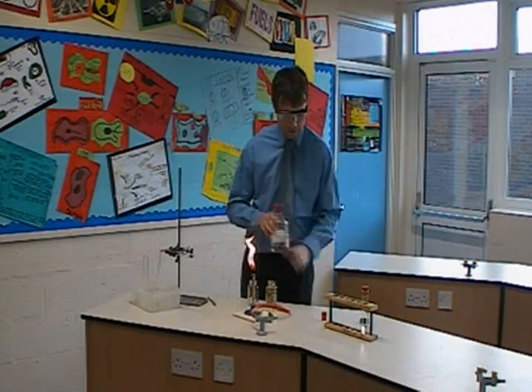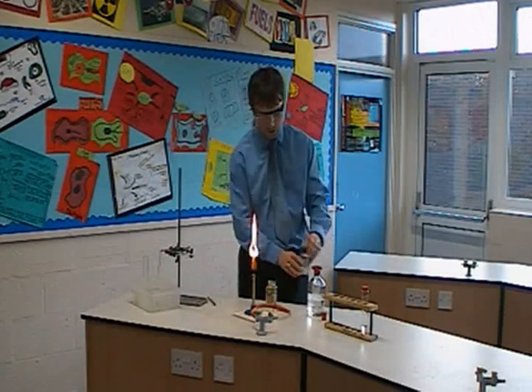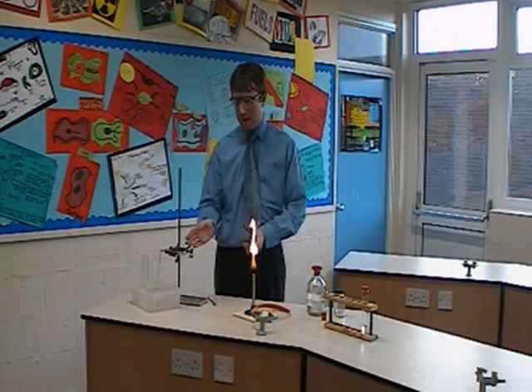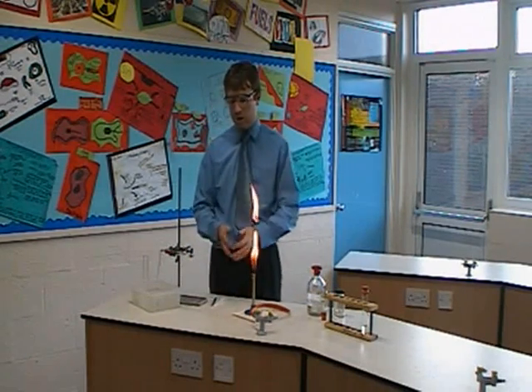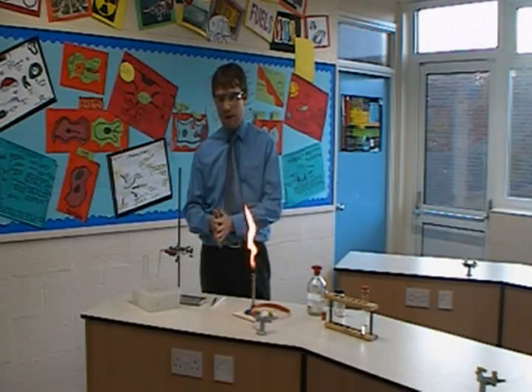The actual procedure of the experiment is really just to heat up the oil and also to move the heat across to the catalyst, so that we're drawing the oil across to break it up into the alkene and the alkane that we need to break it up into.